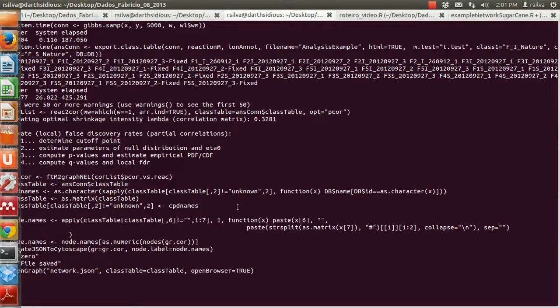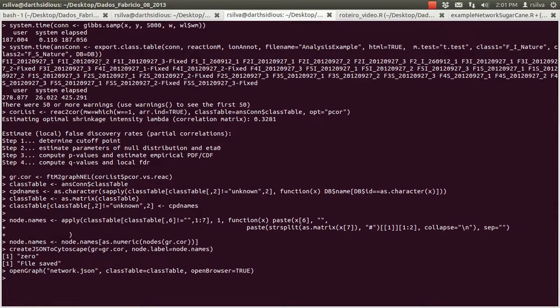The main product of this analysis flux is a matrix with the probability of each mass to compound attribution.